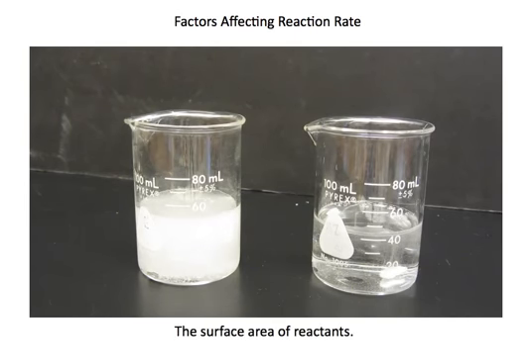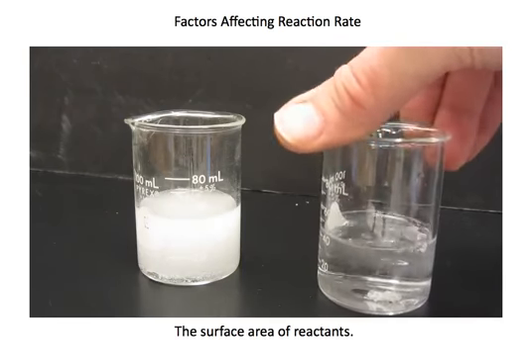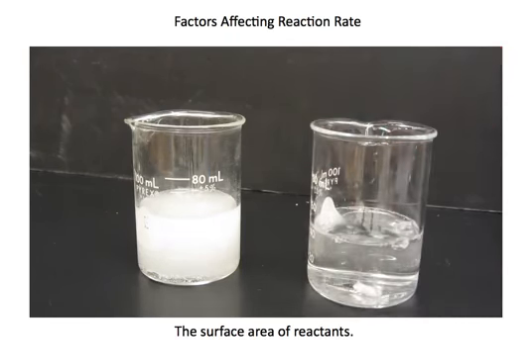So in this example, we changed the surface area. Again, that was adding calcium to water. So calcium as a lump of calcium. Pretty evident the reaction proceeded. It was quite slow. You could see the bubbles of gas forming though.